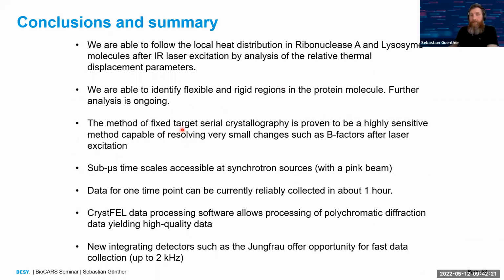So we could show that fixed target serial crystallography works well to detect small changes, like for example in PYP, the change in the chromophore. And this in principle also makes it feasible to do sub-microsecond timescale experiments at synchrotrons with the pink beam, for example at BioCARS with the 100 picosecond X-ray pulse, and maybe also a picosecond pump laser. Currently, we need probably around 1 hour to 1.5 hours for one time point in terms of data collection time, which is then processed with CrystFEL.